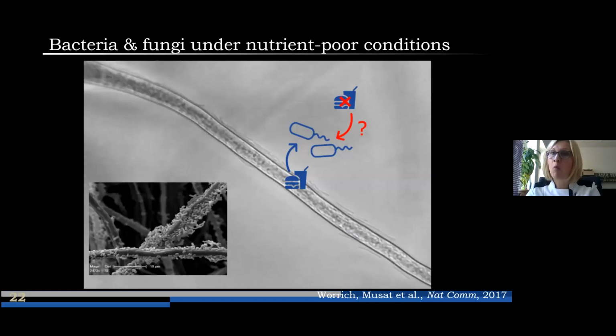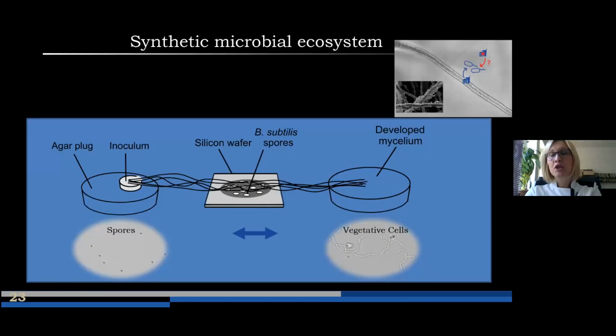So even if you have more than one partner, but you can clearly identify them based on morphology, therefore FISH is not has to be used before the nanoSIMS analysis, because you know the identity of the partners involved. And here I choose to give you an example of a trophic interaction between a fungi and bacteria. It was a synthetic system created in the laboratory, just to give you another example how one can tackle several different questions with the chemical microscopy.